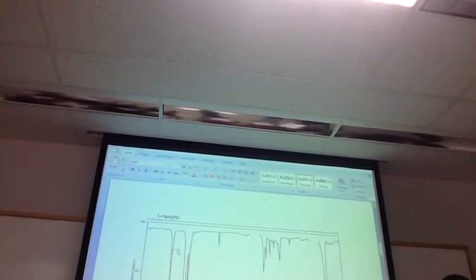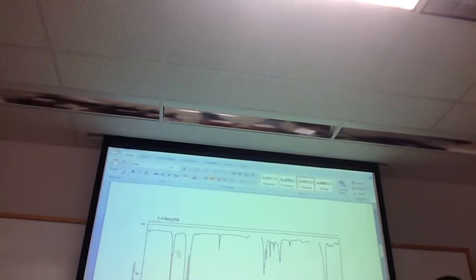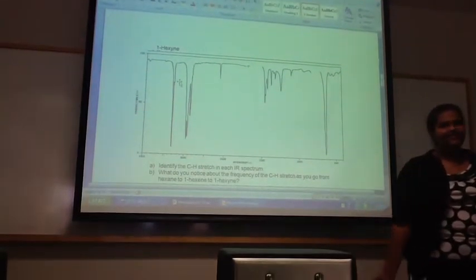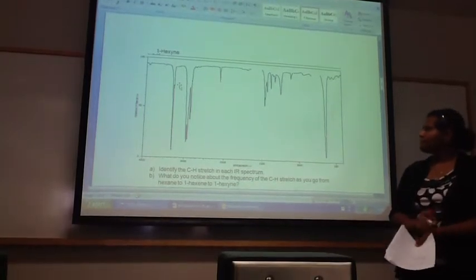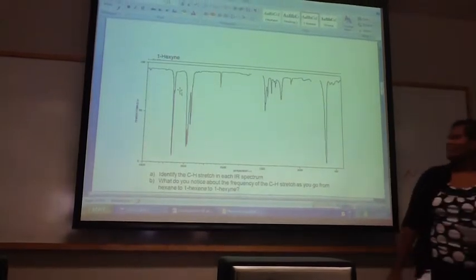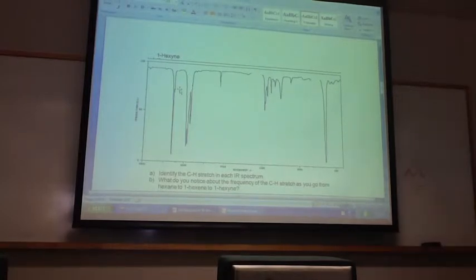For the characteristic infrared absorption frequencies, the second line of frequencies is the fingerprint, and we don't really need to worry about that right now. You should label them both, but don't go into too much detail about the fingerprint. In IR, you cannot identify every single peak. It's just like a fingerprint. Don't worry about the little tiny ones. Just the first two, alkyne and alkane, and identify those as characteristic frequencies.